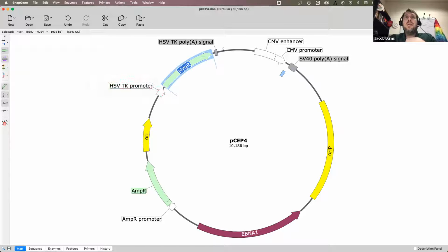So this is the promoter and terminator for a gene that's normally found in a virus, but something that works probably pretty good in mammalian and canine systems, as the description said about this. When you're looking at plasmids, this is one of the things that you want to explore as you're going through.